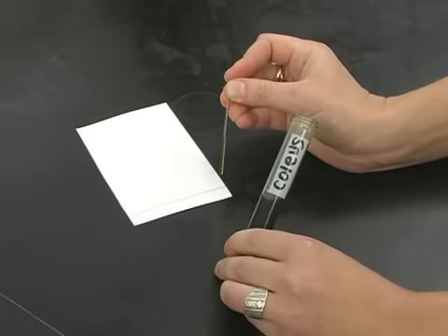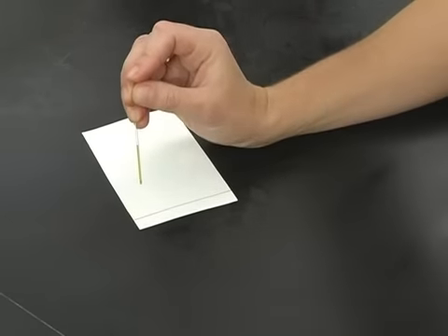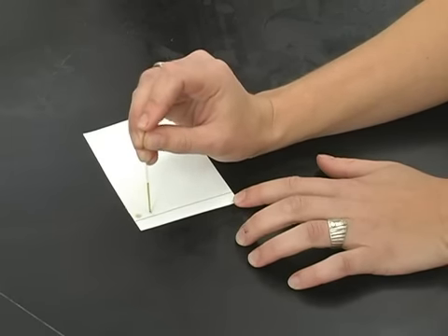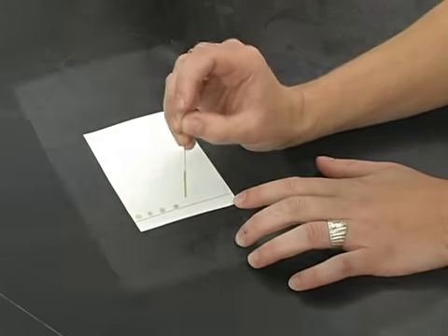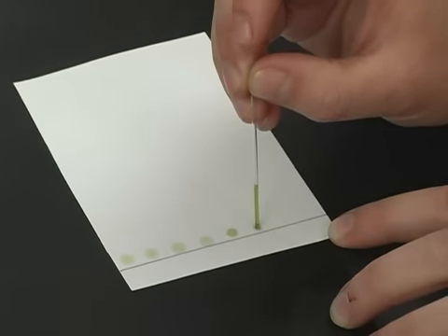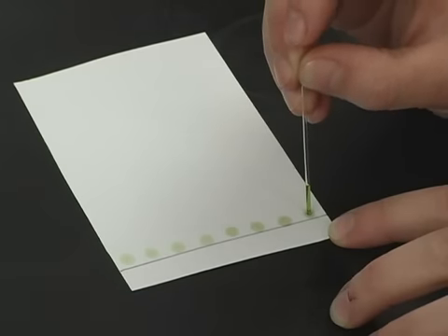Once you have drawn this line, carefully make a pigment drop using the capillary tube. You must apply a very small amount, let it dry, and then repeat often until you have a dark stain of pigment. This will assure good results. And remember, make sure your pigment drop stays well above the pencil line.